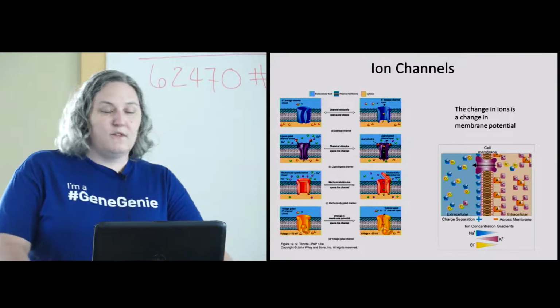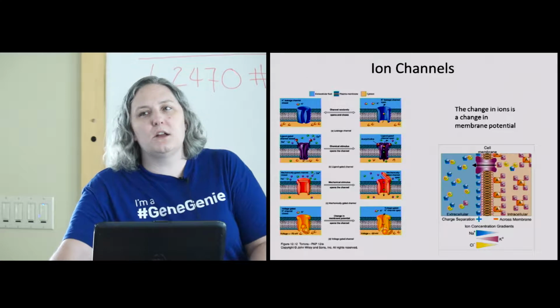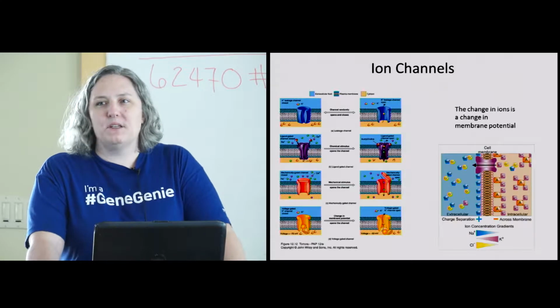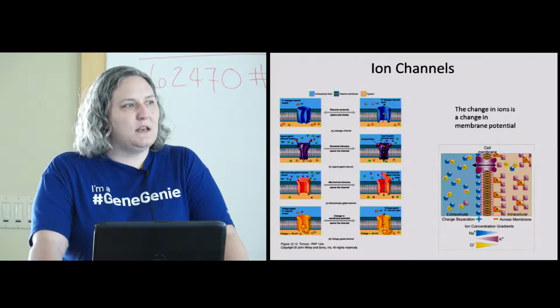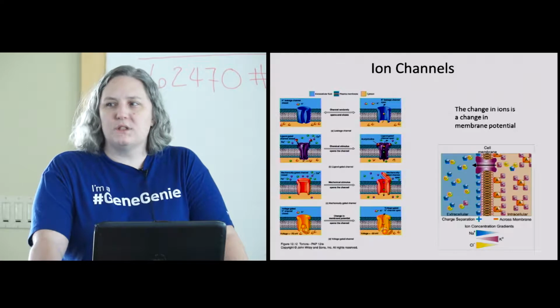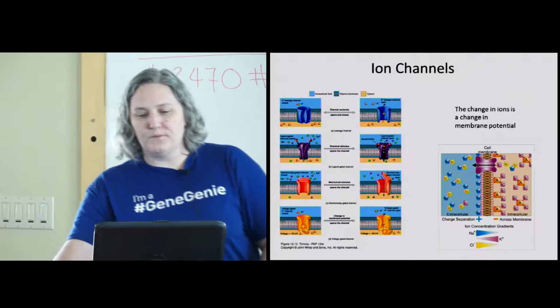You have voltage-gated channels. Those are fairly interesting because they build up a particular membrane potential on one side or the other of the cell membrane. This is what drives all your synaptic processes. So it's a very important feature present in many channels. Now this is important for nanopore sequencing because ultimately we're relying on voltage and membrane potential for driving the sequencing through that nanopore.